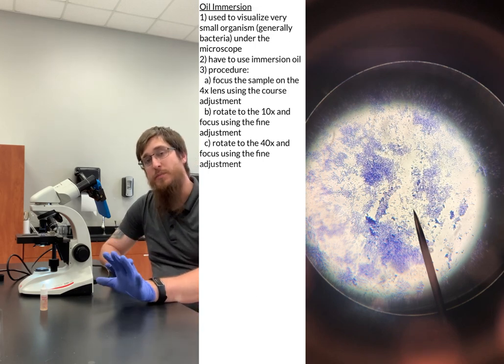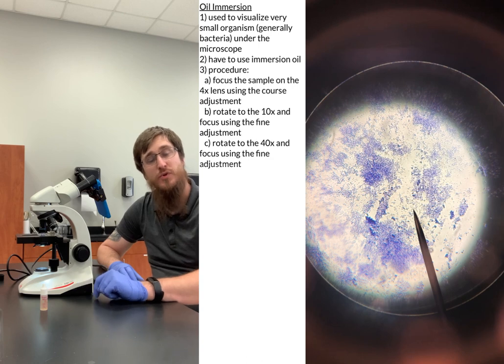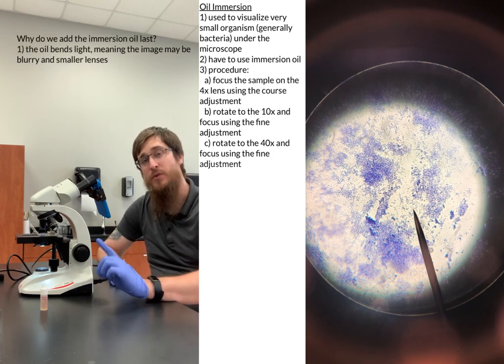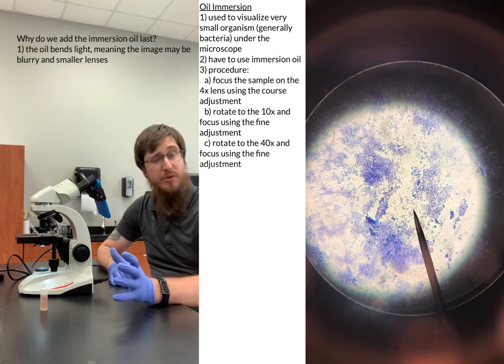And it's kind of important that you go through and you do all these steps first before you add the immersion oil. The oil again will also bend light, so if you add the oil to begin with and then go down through all the different lenses, it might look kind of blurry all the way down through and it can be kind of hard to focus.